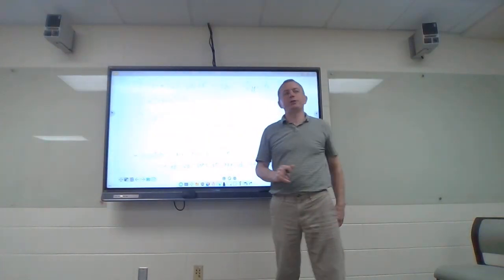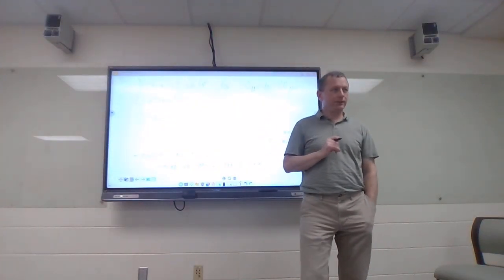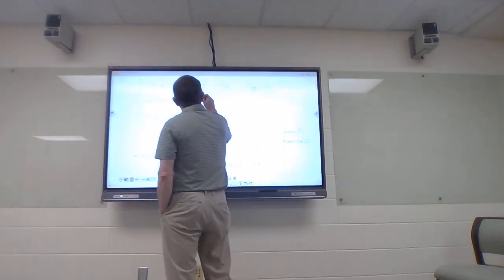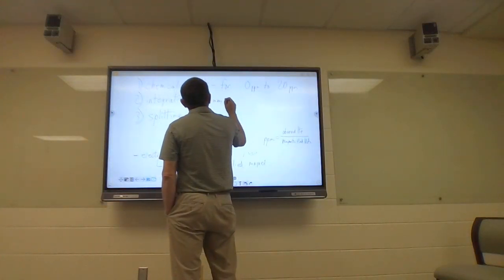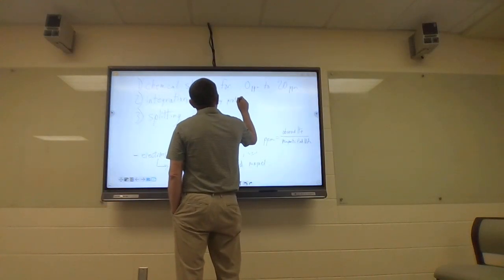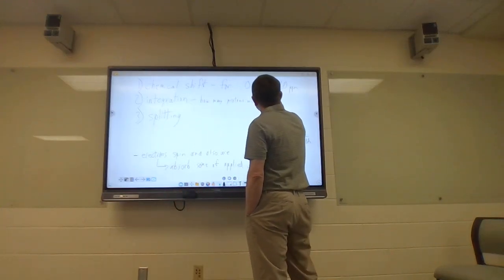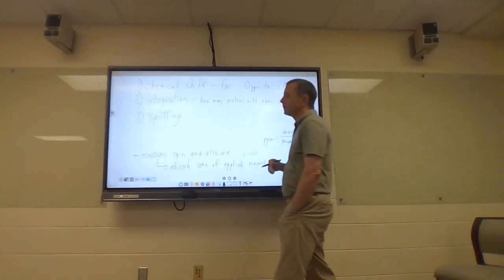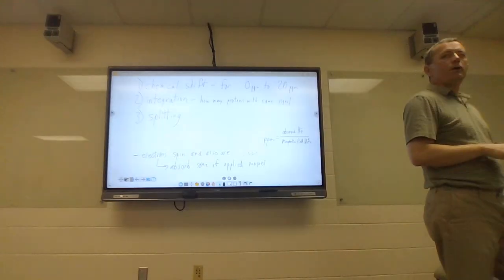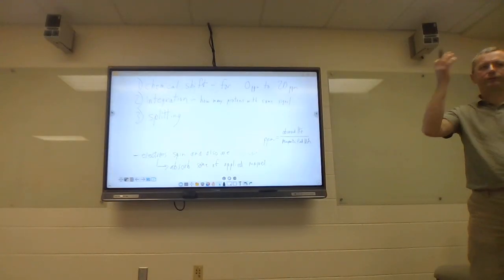So integration is going to reflect symmetry. So all the protons that have the same radio frequency wave signal.